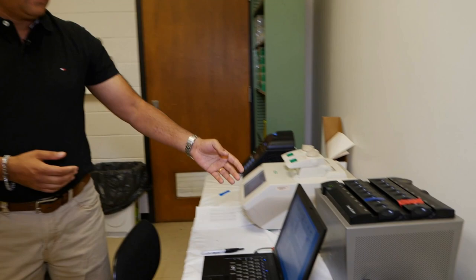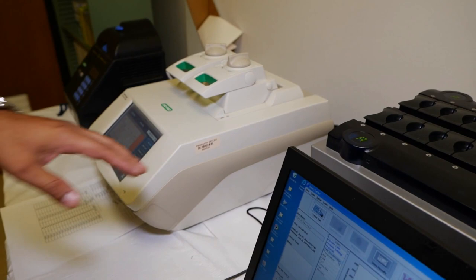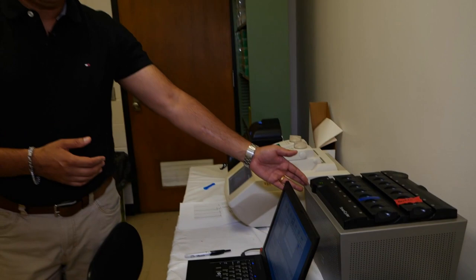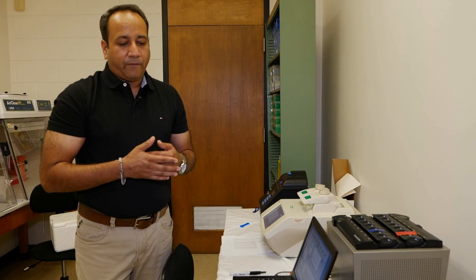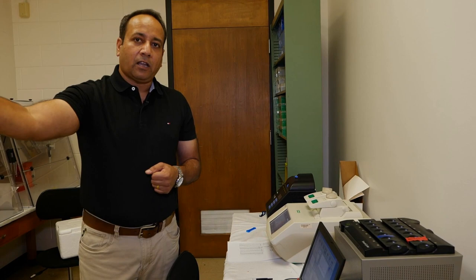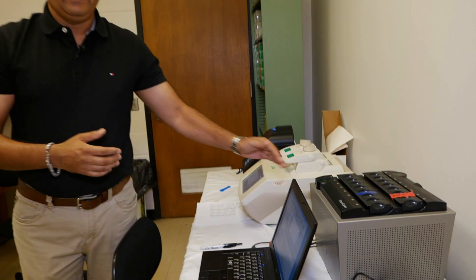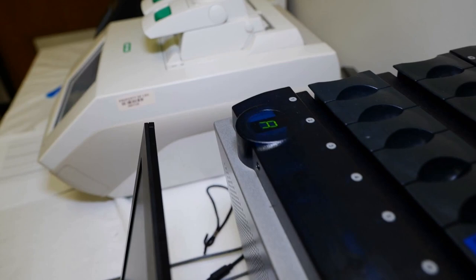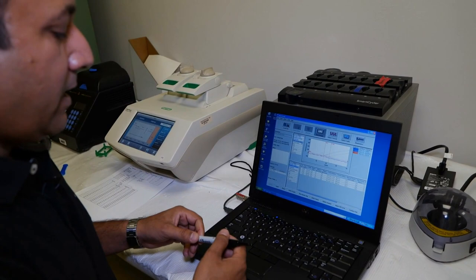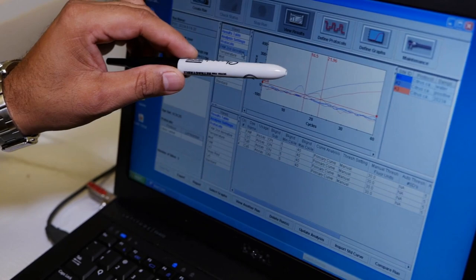This is our PCR room where we run the conventional PCR and the real-time PCR, and this is our real-time PCR machine here. The difference between these two PCRs is that the real-time PCR is in real-time, so you can see the results while this machine is amplifying the DNA. The conventional is that you have to amplify the DNA first, and then you have to run the gel documentation system on it and see the results on the gel. In this case you don't need a gel to run after you run the PCR.